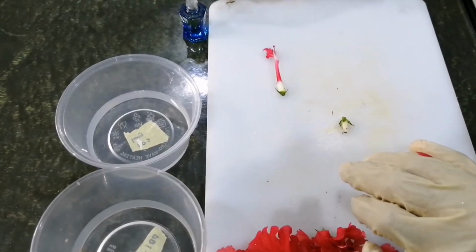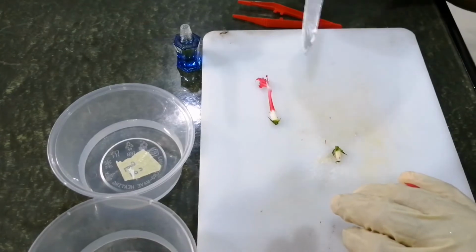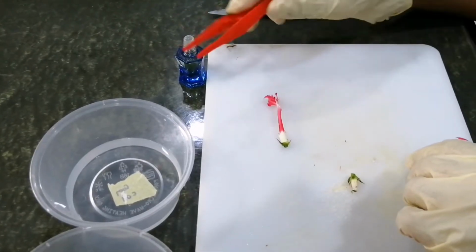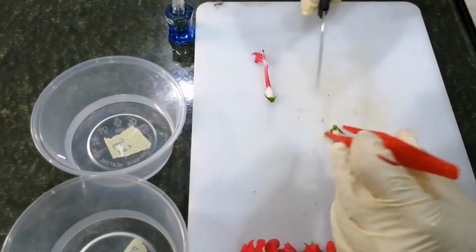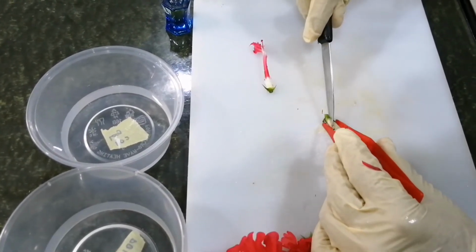So a reminder to all the students is to flame your knife and your forceps before using it, and to let it cool down for a while before using it on the hibiscus plant to dissect the style. After cooling it down, we will dissect the style to obtain the ovary.